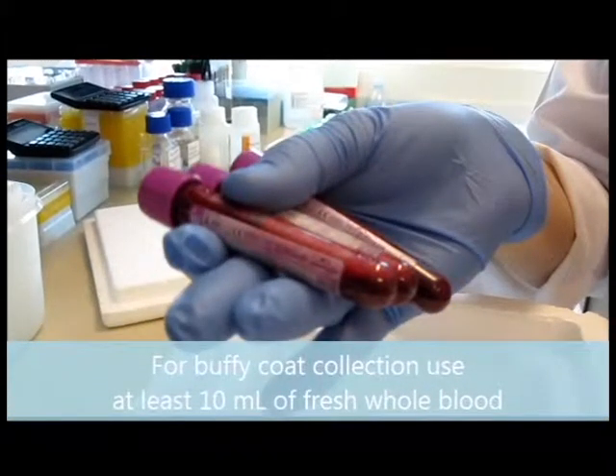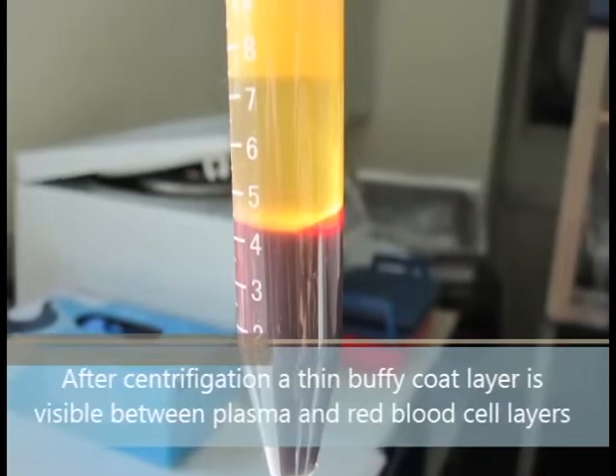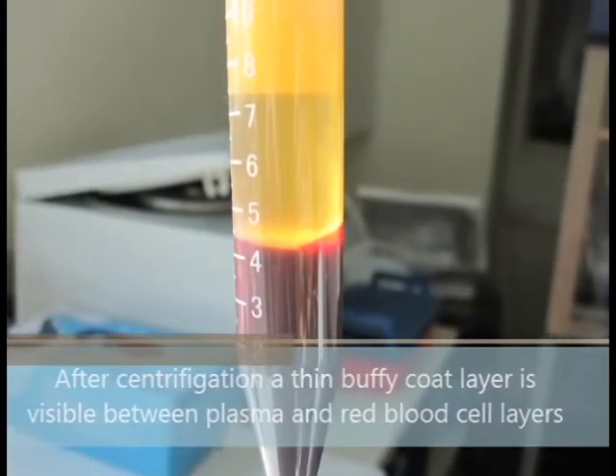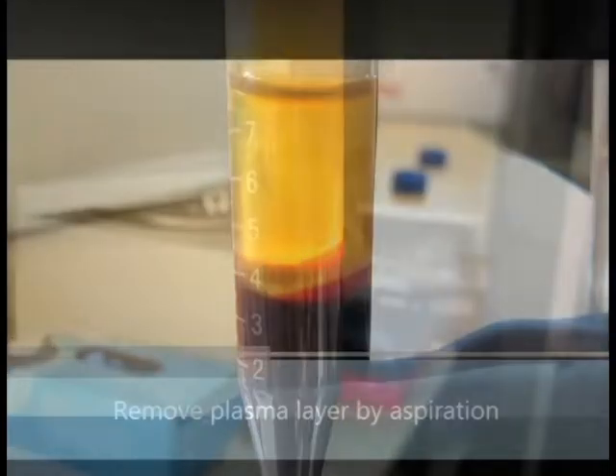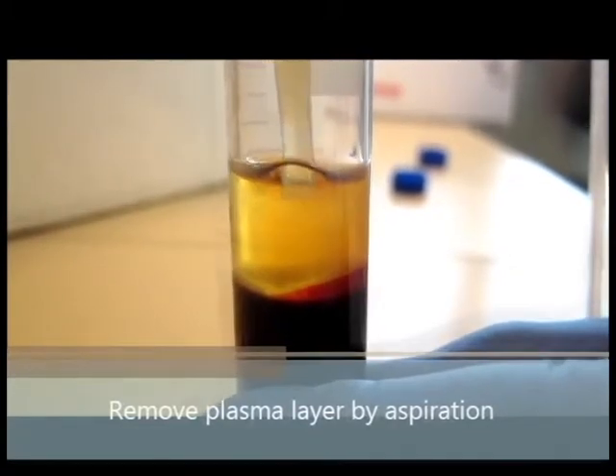For Buffy coat collection, you will need at least 10 milliliters of fresh whole blood. After centrifugation, a thin Buffy coat layer is visible between the plasma and red blood cell layers. Remove the plasma layer by aspiration, as shown here.